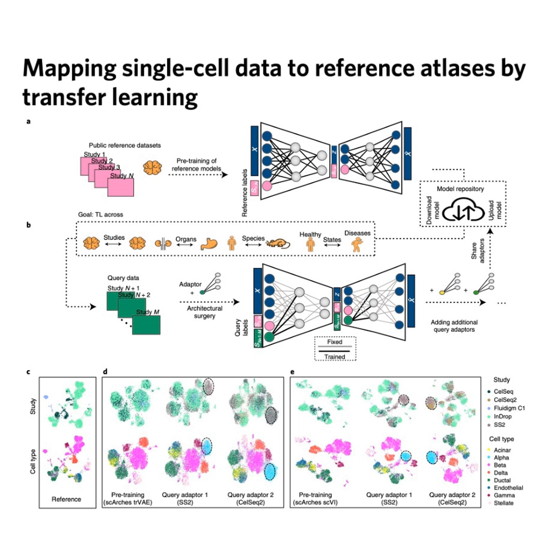So how does that work mechanically? How do you perform surgery on a neural network? Okay, so you start with a base model. scArches uses a type of deep neural network called a conditional variational autoencoder, or CVAE. You might have heard of models like scVI or trVAE. Those are CVAEs. Okay, hold on. CVAE. Can we break that down? That sounds like a technical minefield.